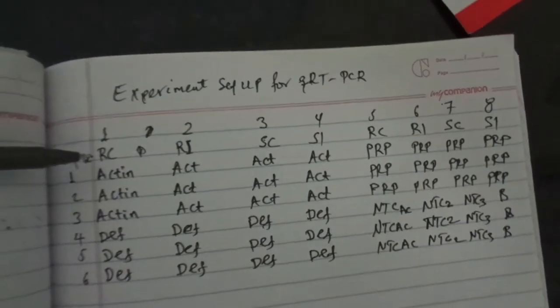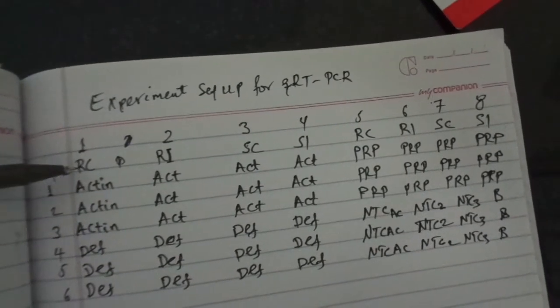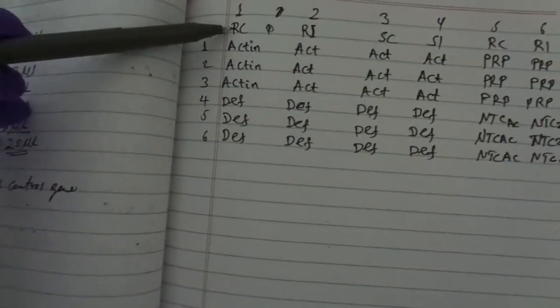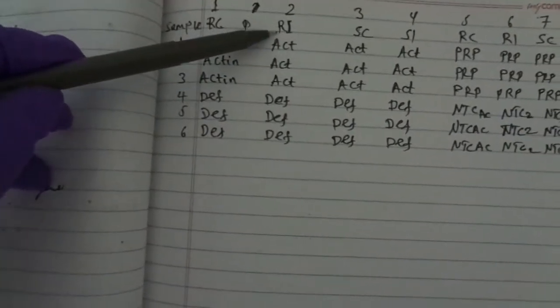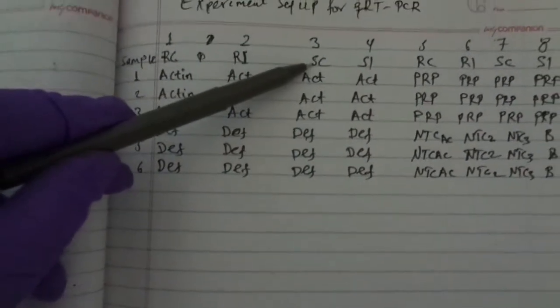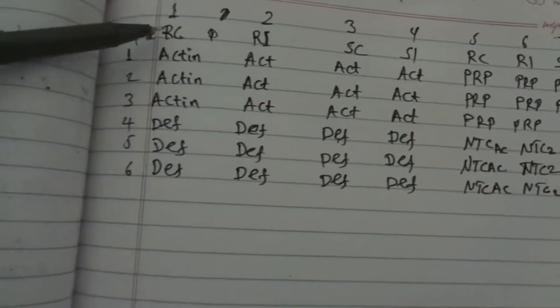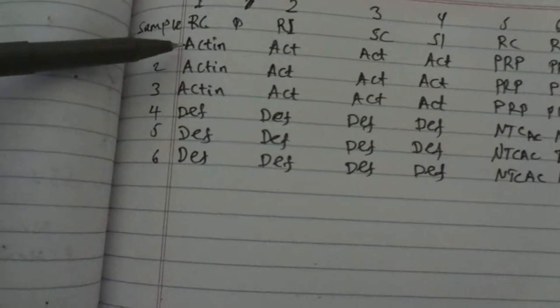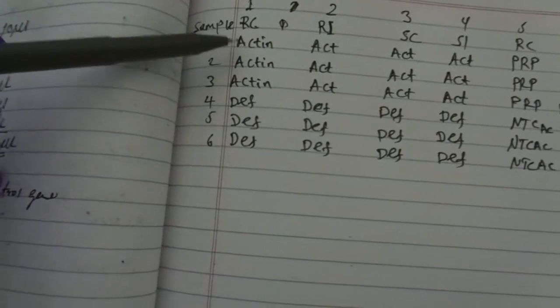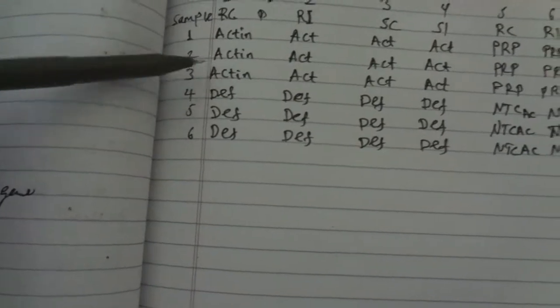for resistance control samples. I do have 4 samples, as I told you in the previous video. So here RC means code for resistance control, then resistance infected, susceptible control, susceptible infected. According to this, I set up resistance control actin, that means the internal control gene actin, with 3 replications there.